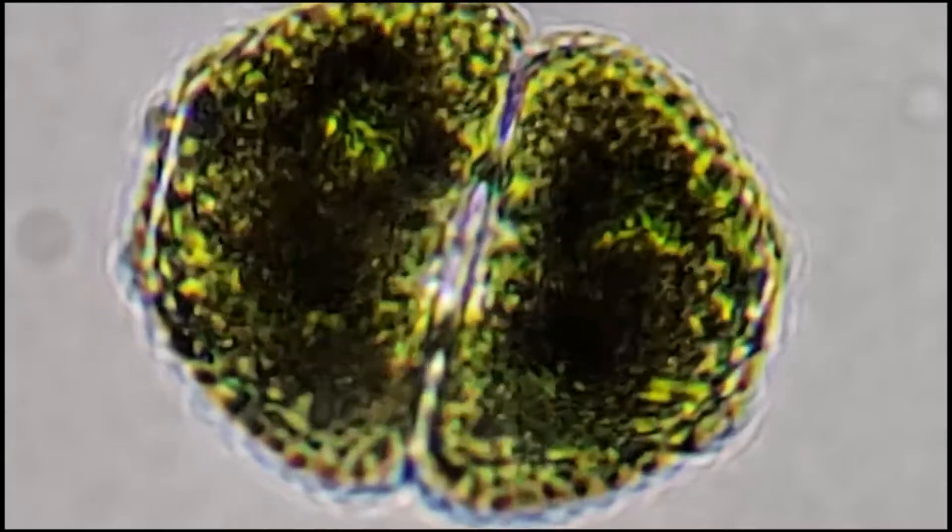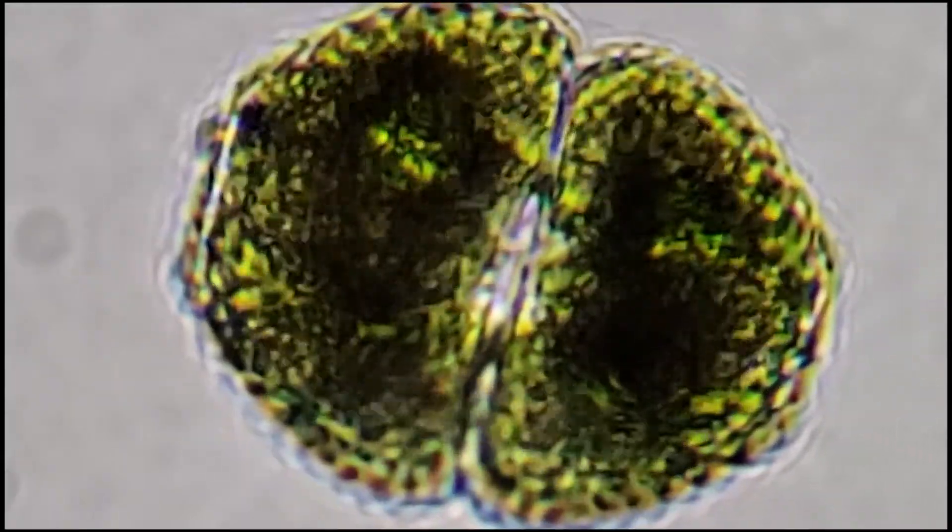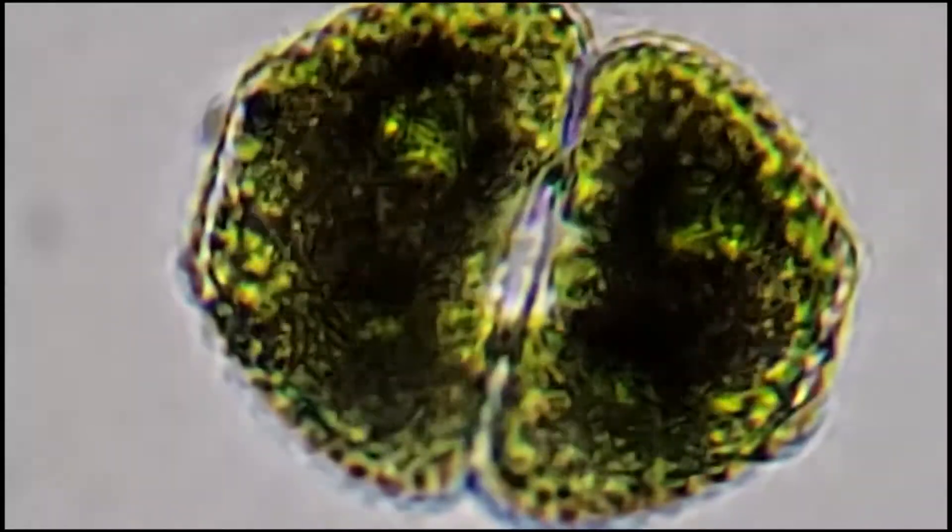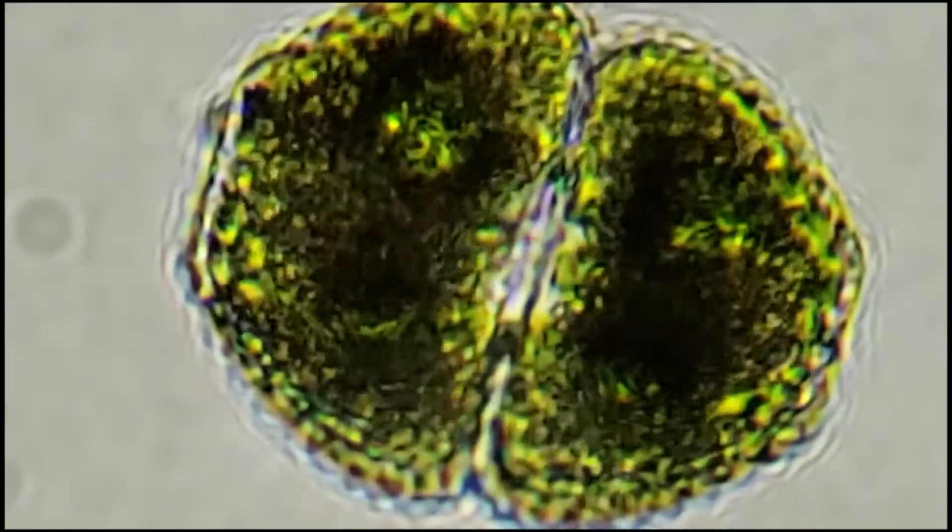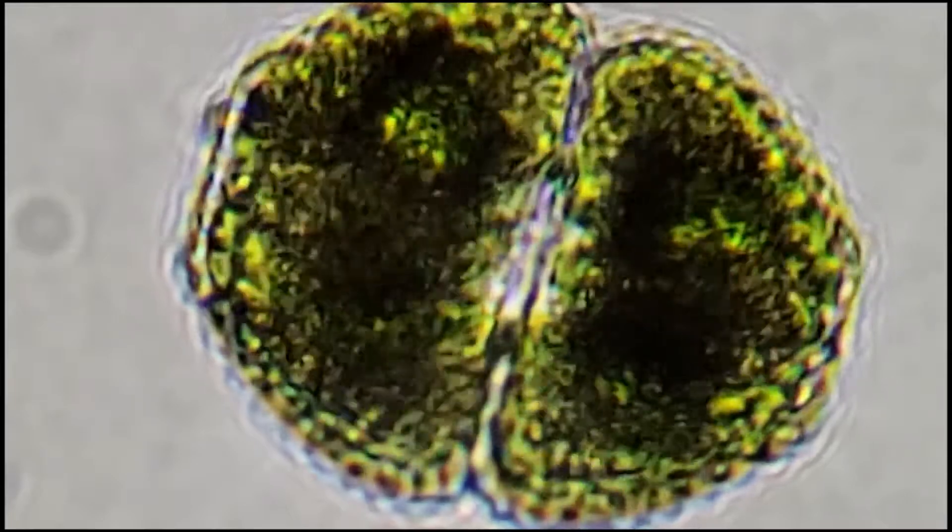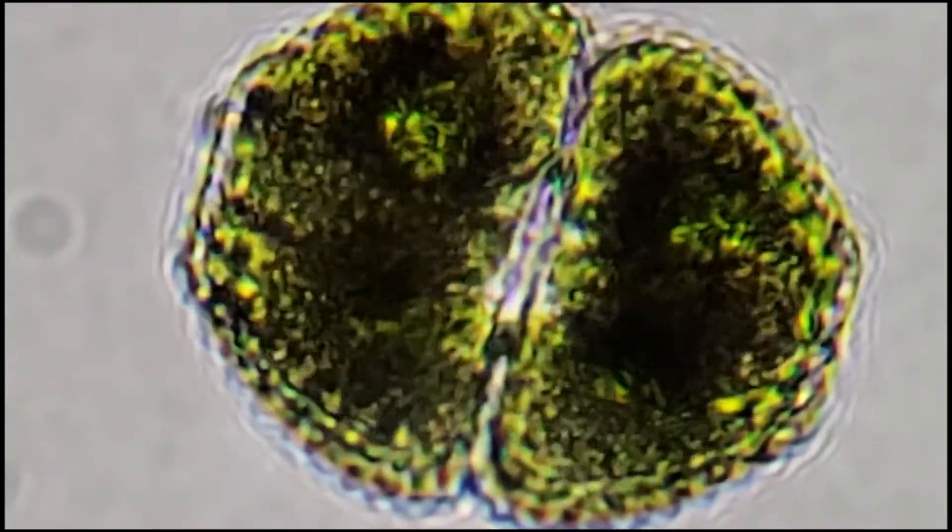Going back to the Cosmerium individual we were looking at before, I still haven't answered the question about what is moving inside the cell, but digging a little deeper unearthed a lot of things about Desmids that are very interesting, including the unusual vibrating cytoplasm.